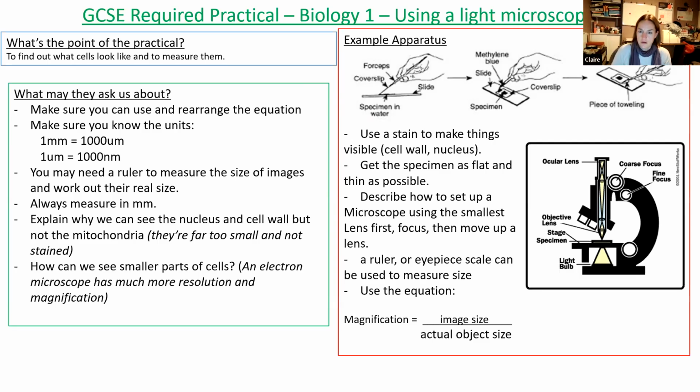Any questions on the microscope required practical? You can let me know. It's quite a nice, easy one. Typically, the main questions are setting it up, and the other one is measuring.